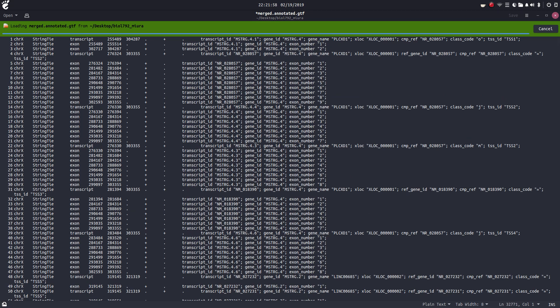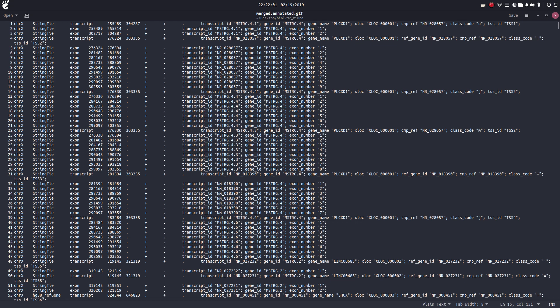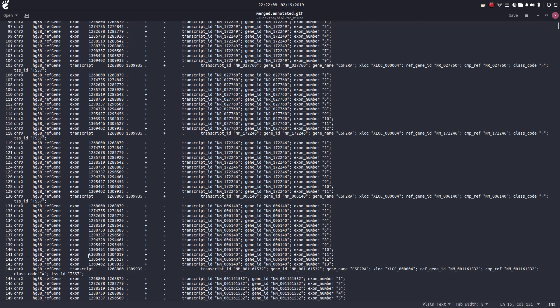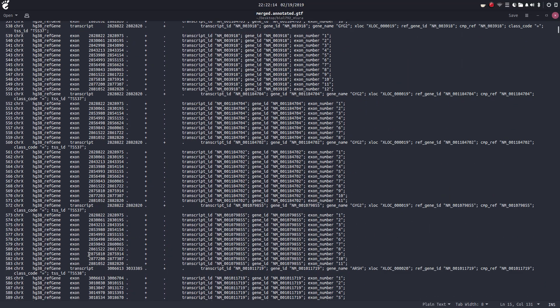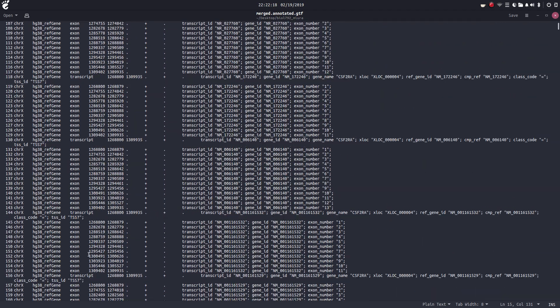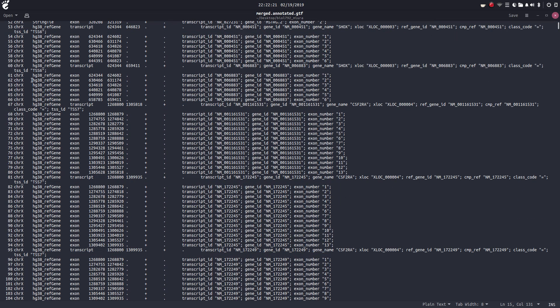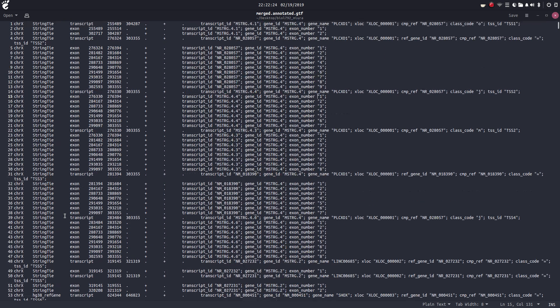We're going to open this annotated GTF file up. We have our chromosome, our transcript which is an exon or an intron. Scrolling down - actually it's just all of our exons. There's our reference genome, start positions, stop positions, strand location - positive or negative strand - and then we have a brief description of what this gene is, including exon numbers and transcript IDs. That's a pretty cool file.